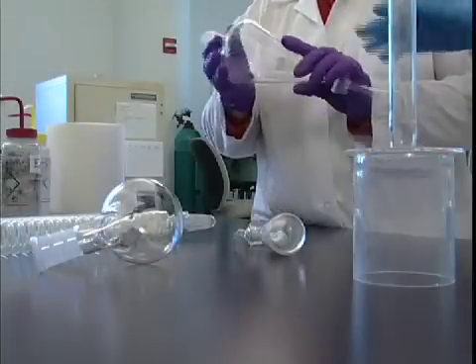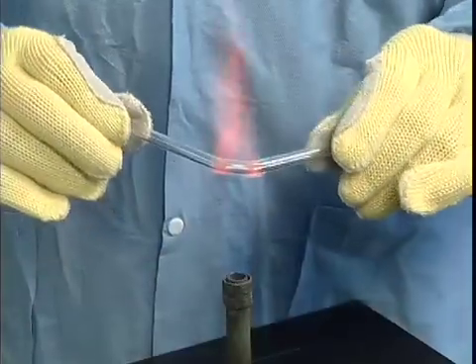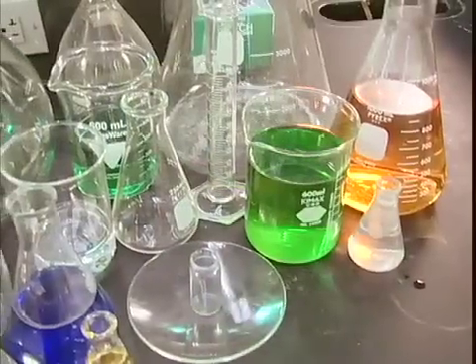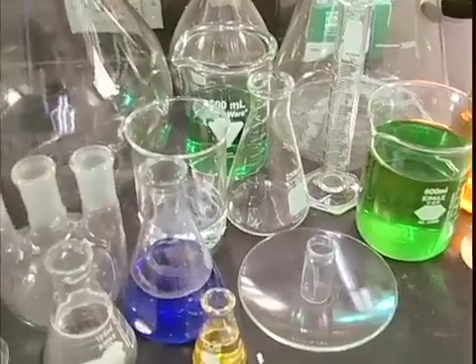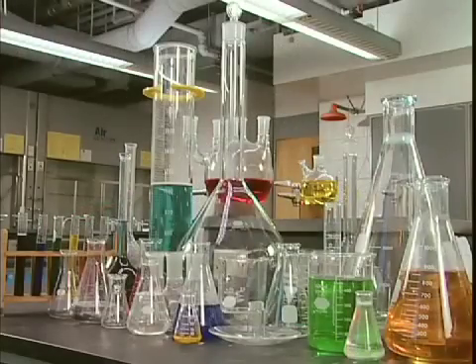Where would we be without glass, a material that's been refined across centuries of invention and reinvention? In the laboratory, glass is everywhere: beakers, flasks, bottles and jars, tubing, stirrers, pipettes and funnels. All made of glass, and as a result, all very fragile.